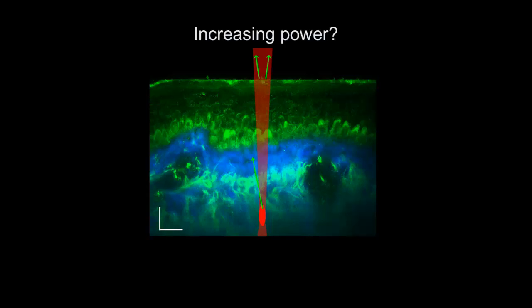So also the other thing, I don't know if this is important or not, but you said that for the second harmonic generation you're using 770, and so your second harmonic is below 400. I imagine that can be absorbed a fair bit as it travels back. Yes, of course. And on the way out there are also attenuating factors that don't work in your favor. But it differentially hampers the second harmonic signal relative to the fluorescence. Yes, that's right. So you're going to lose second harmonic faster than fluorescence. That's correct, that's absolutely correct.